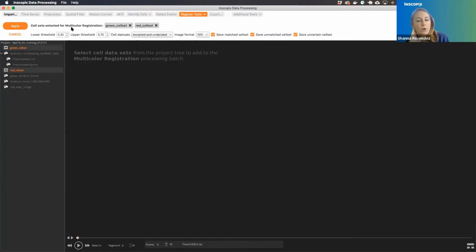I think if we don't have something, we should create, and by we, I have no idea who yet, some examples showing good ROI drawings and bad ROI drawings that we could share. Giving people the bad ROIs is always really helpful, just to say, don't do this. I don't know who will work on it, FSC or the on-site support team, but maybe someone can come up with that.